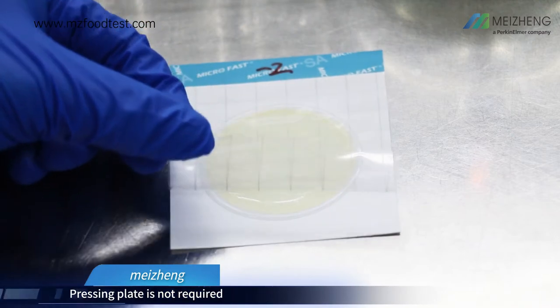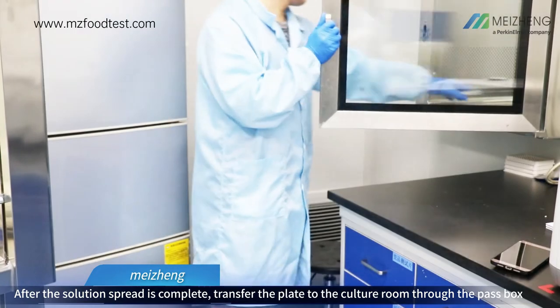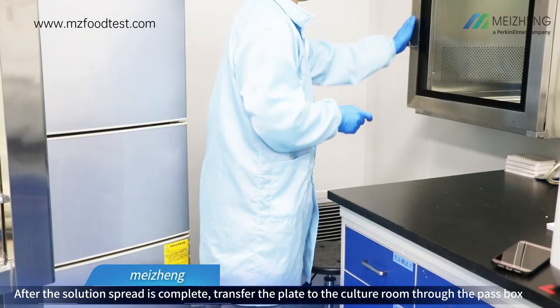Pressing the plate is not required. After the solution spread is complete, transfer the plate to the culture room through the pass box.